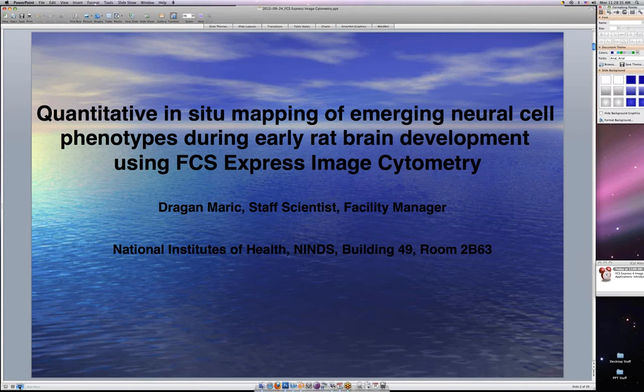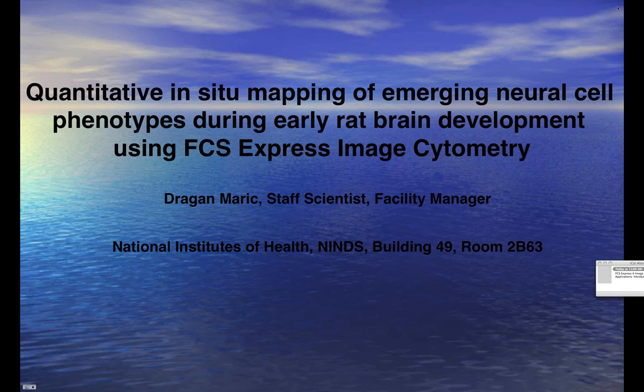Okay, so thank you, Sean, for this nice introduction into my domain of trying to use the FCS Express Image Cytometry to get very insightful data from system biology type questions that we need to address.